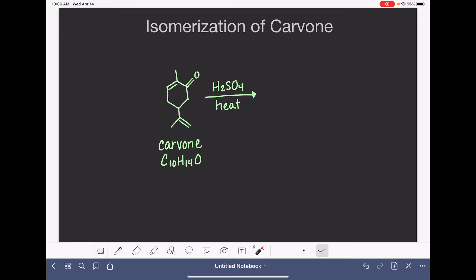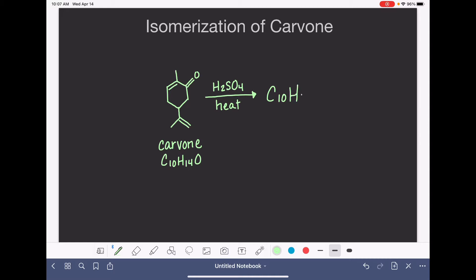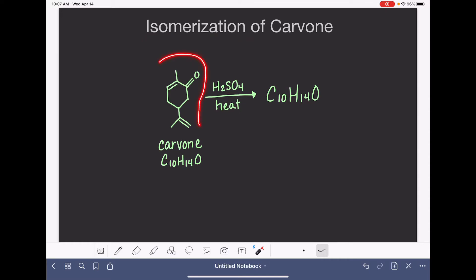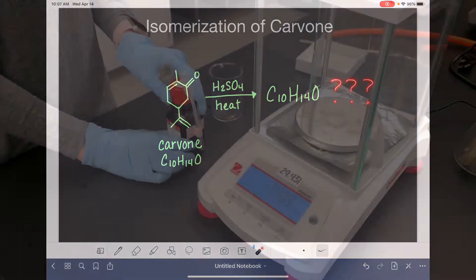To perform the isomerization, I'm going to mix some carvone with 6 molar sulfuric acid, and allow the carvone and the sulfuric acid to heat under gentle reflux for about a half an hour. The product of this reaction has the exact same molecular formula as carvone — C10H14O — and because it is an isomerization, we're simply rearranging the molecular structure. The goal of this experiment is to determine the actual structure of the isomerization product. The experiment itself is pretty straightforward, so let's just watch.